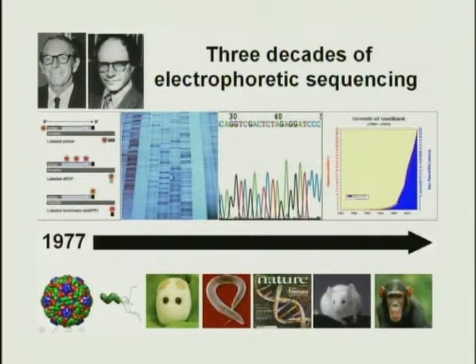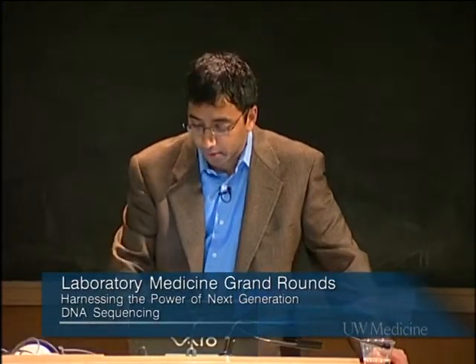And overall, through the automation of this process and its essential scale-up and optimization through the Human Genome Project, there was essentially an exponential increase in the throughput of sequencing over several decades. This is shown here by a graph of the overall amount of sequence deposited in GenBank. Starting from essentially the first paper on sequencing, which included a report on the genome of a bacteriophage, the community as a whole worked its way up the food chain, culminating in the Human Genome Project and subsequently moving on to other genomes of equivalent size using the infrastructure that had been developed over these years.